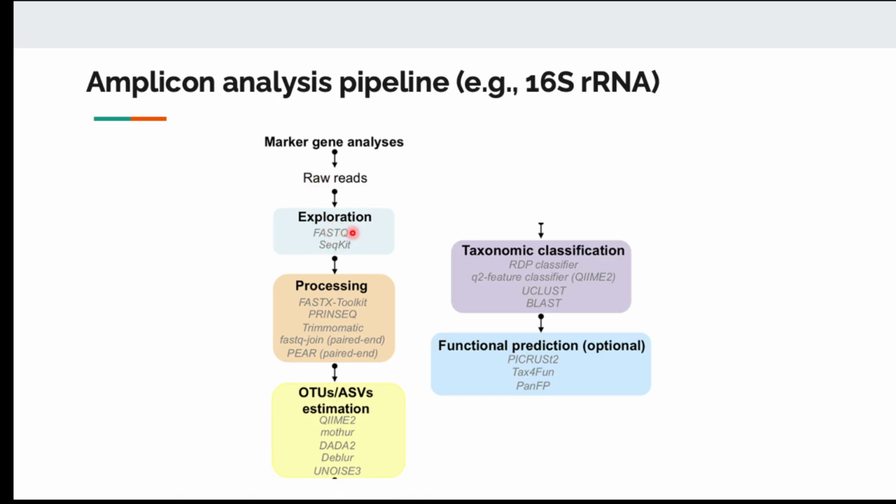You can do QC like before, because these are sequencing data. For processing, again, you can do Trimmomatic, like to cut out the adapter, same as before. But now you want to classify the taxonomy. There are 2 steps. First, we want to cluster similar reads into OTUs. So reads that look very similar, like maybe 99% similar, we want to group them together.